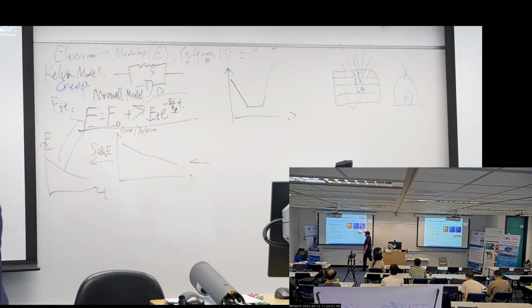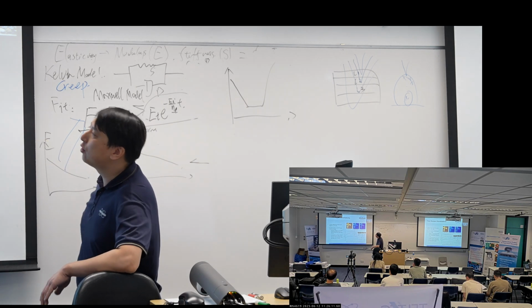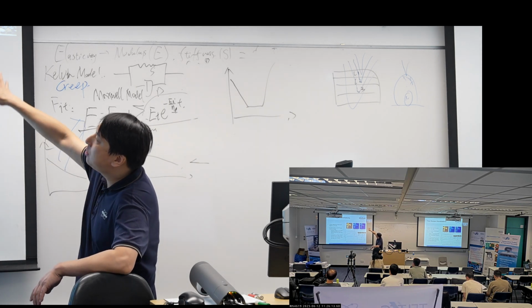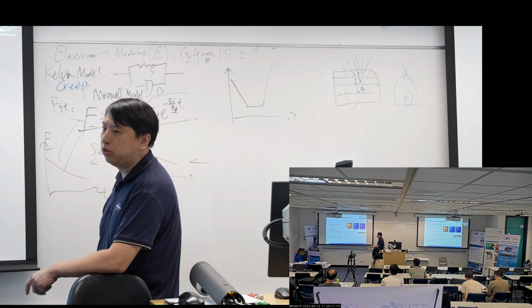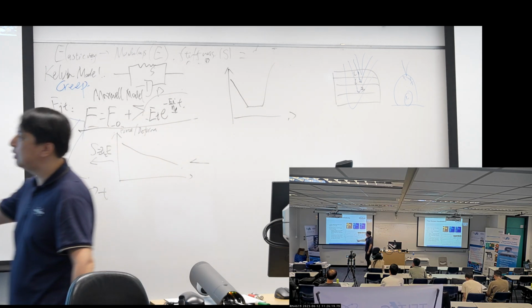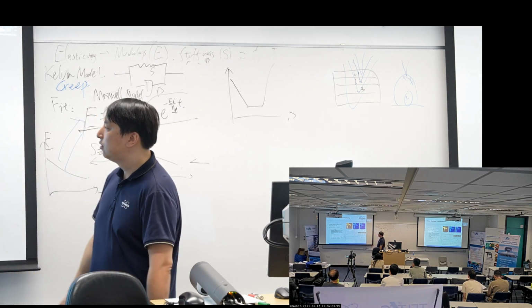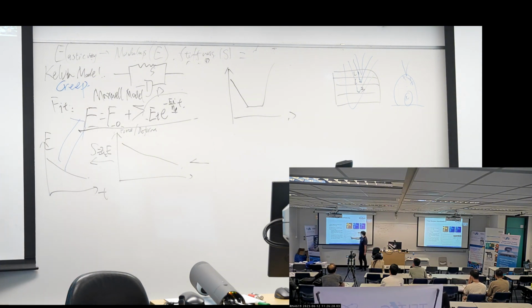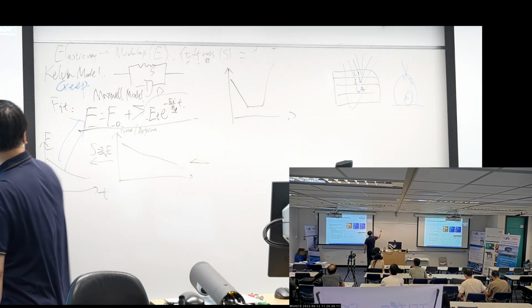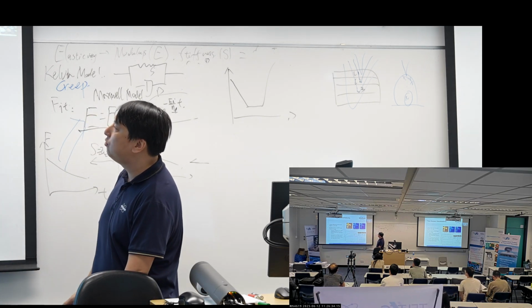He is doing the creep, and he did a force volume. On each point, he has a creep experiment, and he holds the force for 5 seconds. So he holds the force for 5 seconds, and then he can capture the Z change against time on different regions.